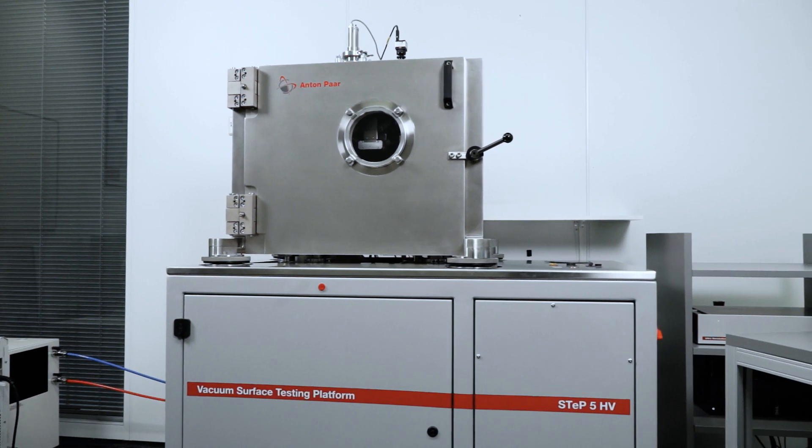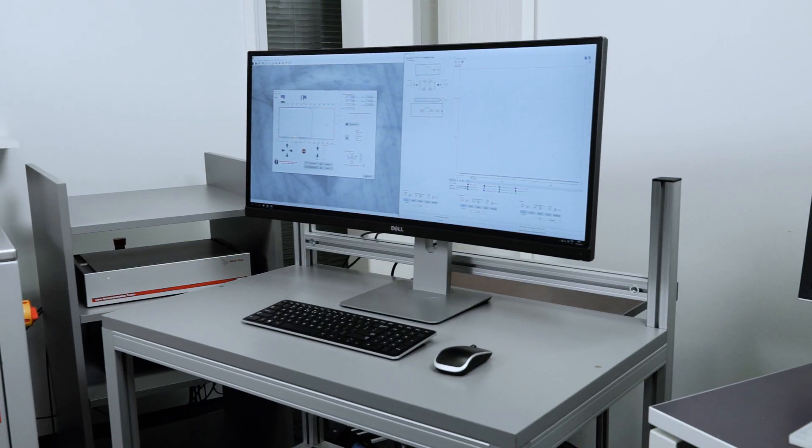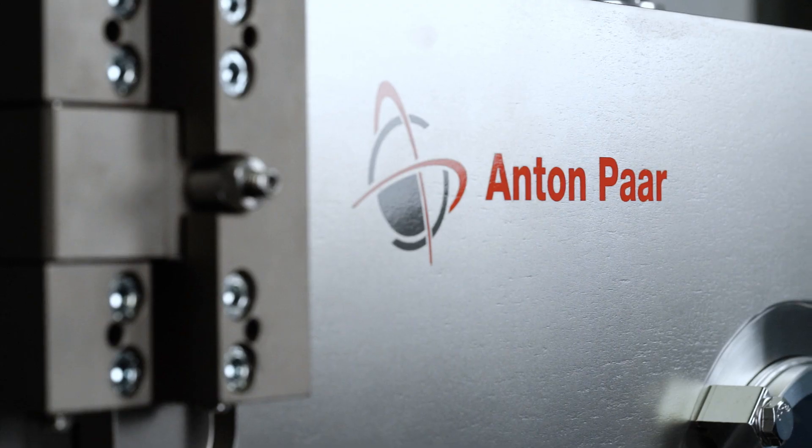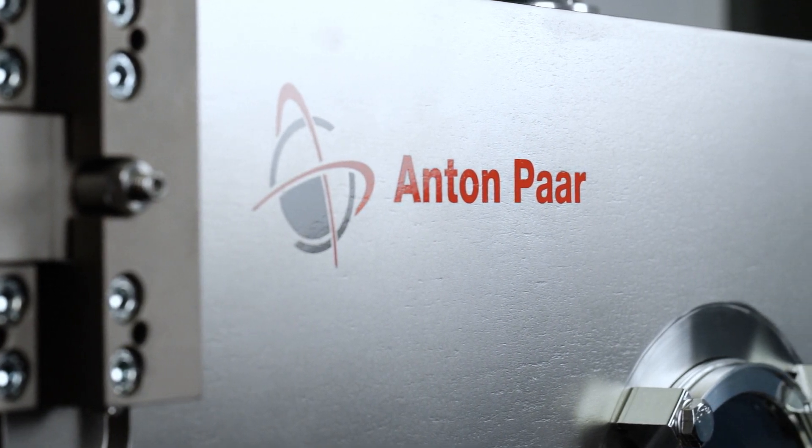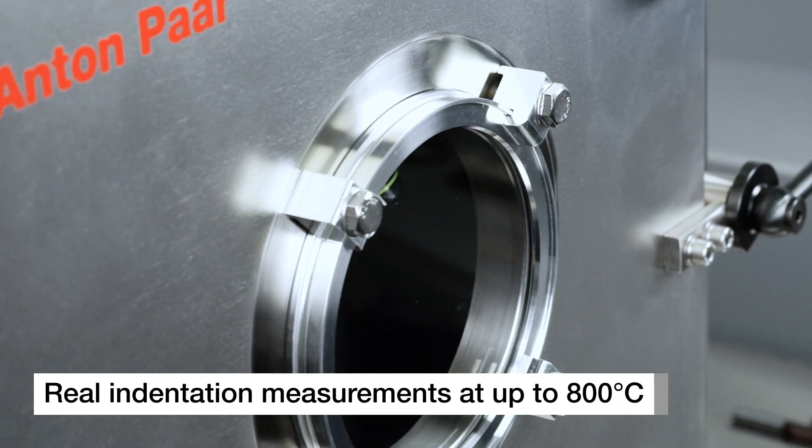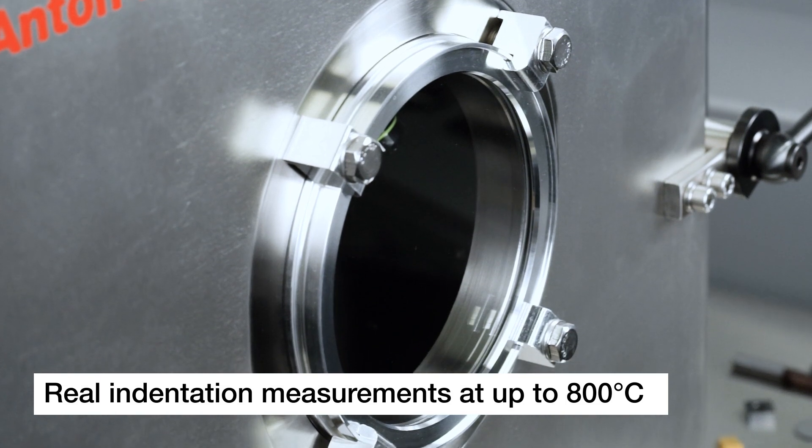The high temperature ultra nano indentation tester UNHT3 HTV measures the hardness and elastic modulus of thin films and coatings up to 800 degrees Celsius.